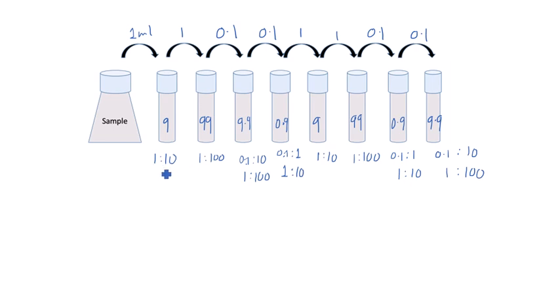So now we just have our working dilution factors here. I'm going to underline them so we can see them. Okay, there you go. To figure out the total dilution factor of the tube, all you have to do is count zeros. That's the easy trick. Here there's only 1 zero, so this is 10 to the power minus 1.